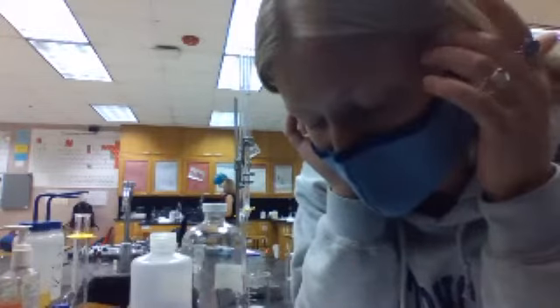Okay. Who has the graph out? Will you unmute and say? We all do. Yeah, we all have it up. So we'll be checking to make sure it's right. Okay, the volume is down. And on the graph it says beginning of NaOH and end of NaOH. For that, he just said to write the initial and final volume on it. So let me go ask just in case. I don't know if that's the initial and final volume of the entire thing or after we take the 1 milliliter. I'm not sure. So let me go ask.